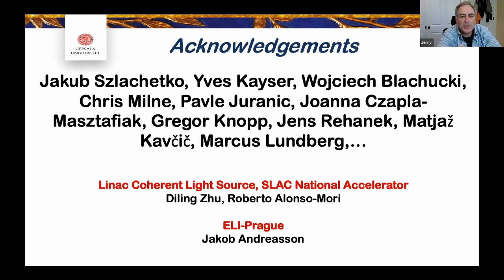And I'll just comment also that in the XFEL studies we've done on nanophases compared to bulk phases, we find that the nanophases are more resistant to X-ray induced hot electron effects because of the escape length of the hot electrons. But what was your experience? This is exactly also what we saw. For example, you could run the sample for a lot longer with the iron oxide than you could, for example, with the iron cyanide.